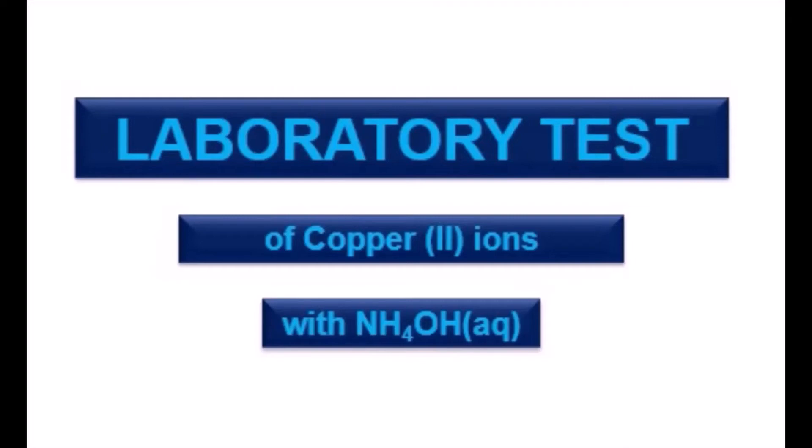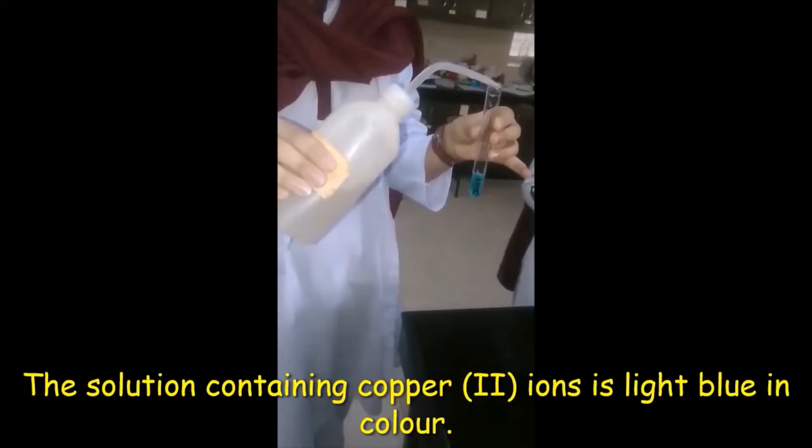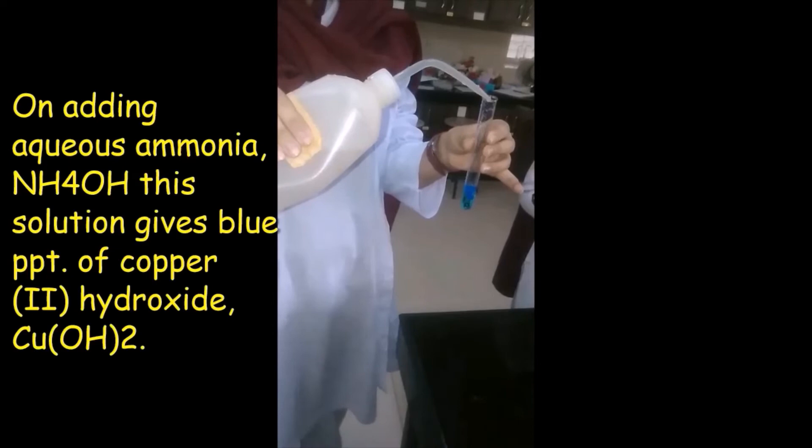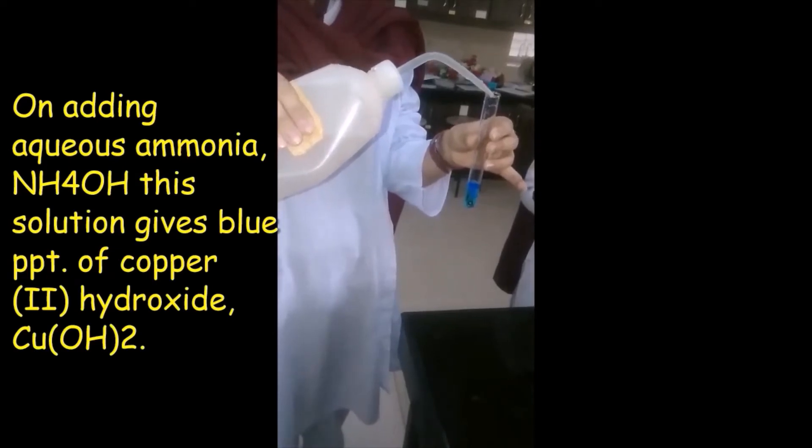Laboratory test for copper 2 ions with ammonium hydroxide. The solution containing copper 2 ions is light blue in color. For the test, take about 1 ml solution of copper 2 ions and add aqueous ammonia, which is also called ammonium hydroxide.